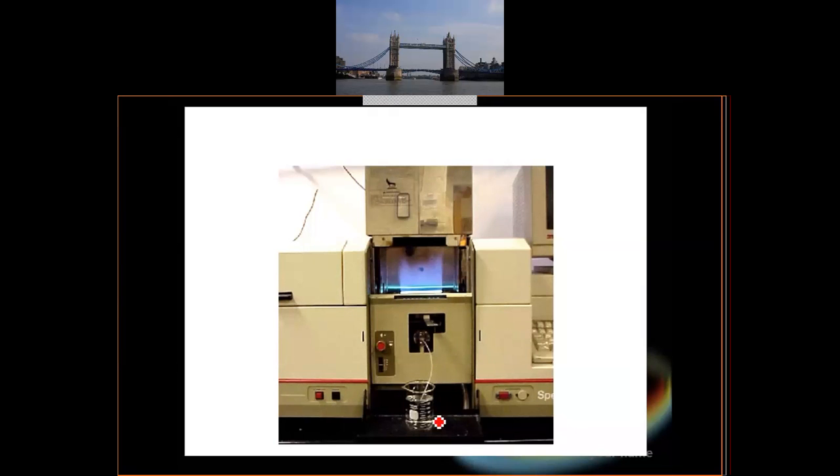Okay. This is where I said a beaker. So sample will be sucked and then will be burned here. This is the flame. Nampak api kan? We can see the fire here. And then normally this is the light source. You can see the handle where we can lift it up. We can lift it up. And the detector is here. And the read device is there.